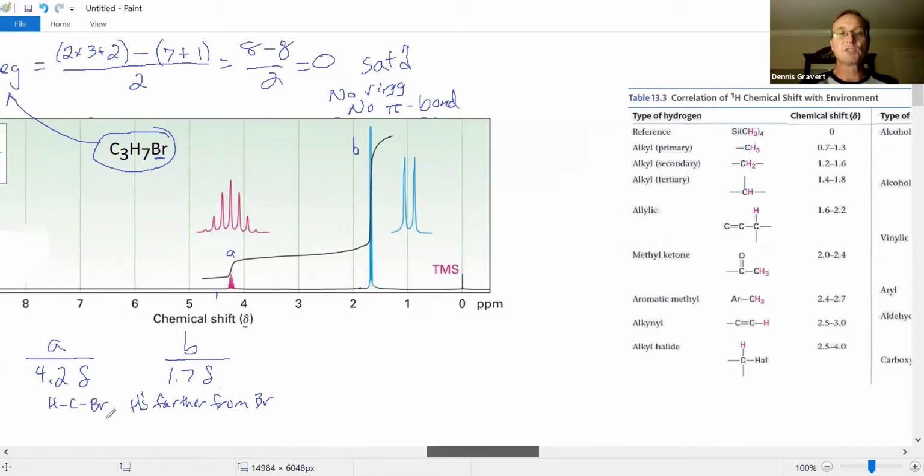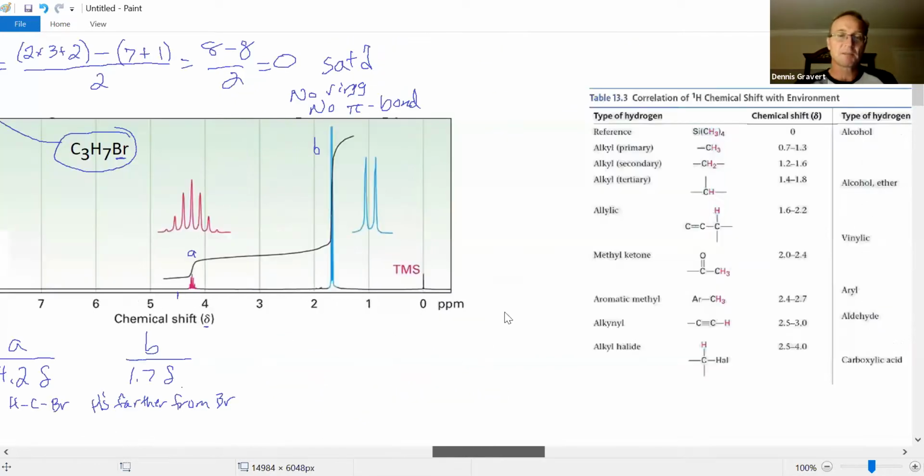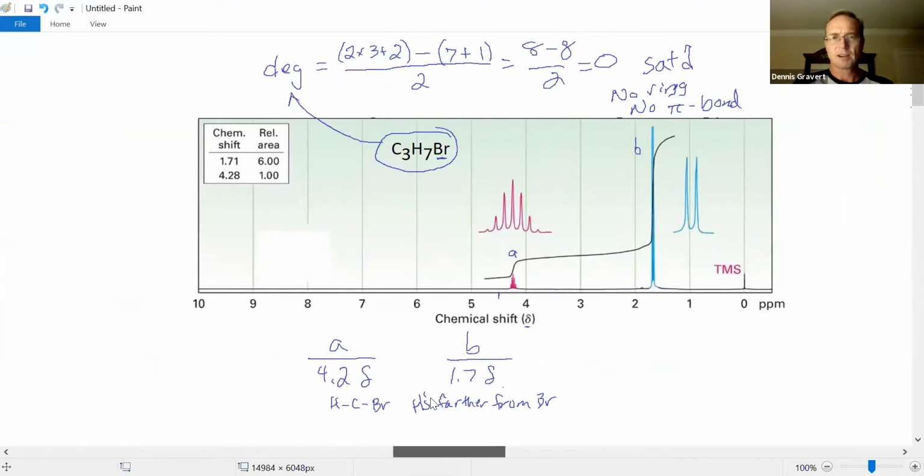Okay, we dealt with 2 attributes of the NMR spectrum. We have the peak position and the peak numbers. Now let's look at integration. Well, they did report the integration curve, so we could try and guesstimate that height, but why? Over here is better data. We're actually told the ratio.